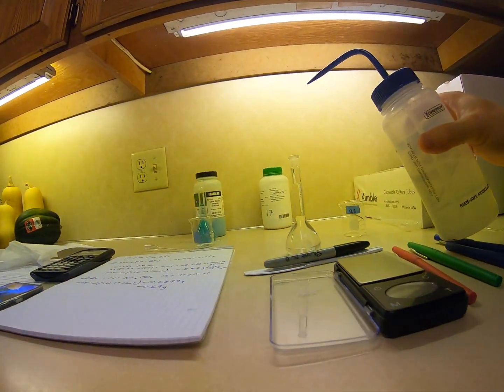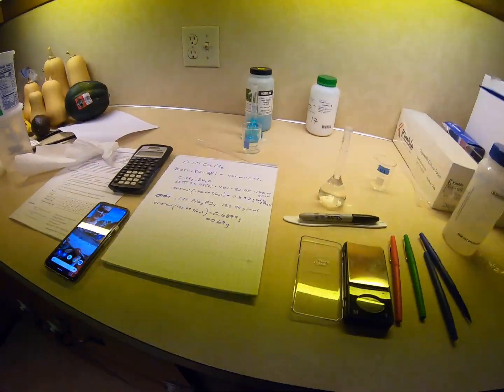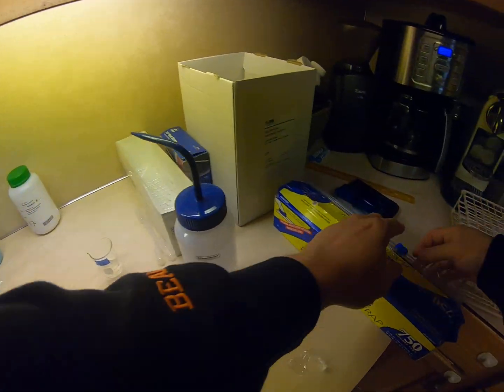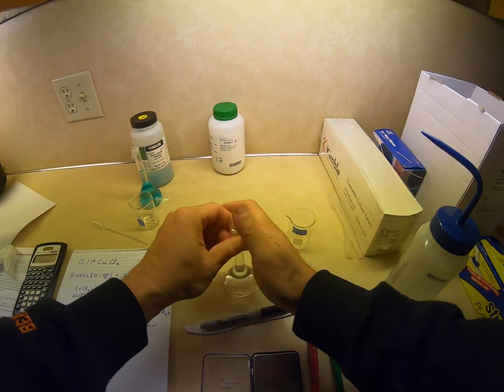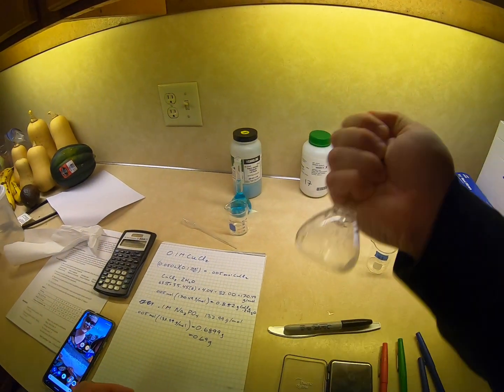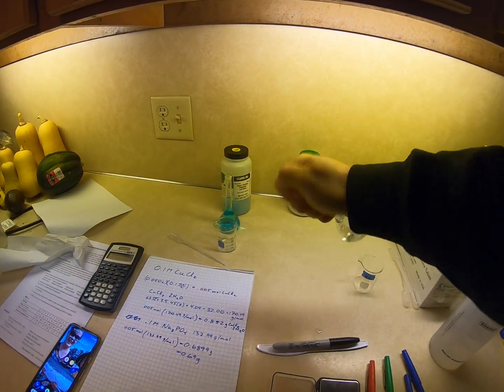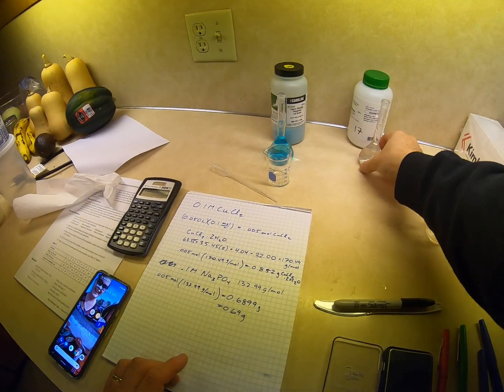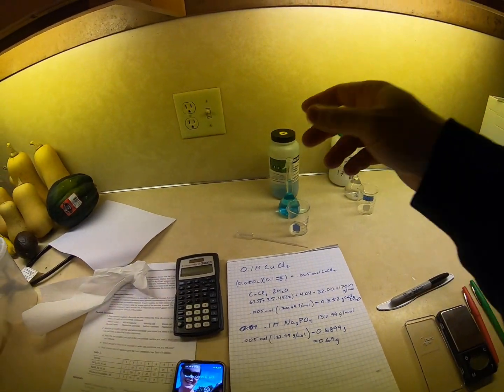Pretty darn close. Oops, overshot just a touch. I probably should have just stayed. We're going to call it good because it just needs to be 0.1 molar with one significant digit. All right, so there's my sodium phosphate and copper chloride.